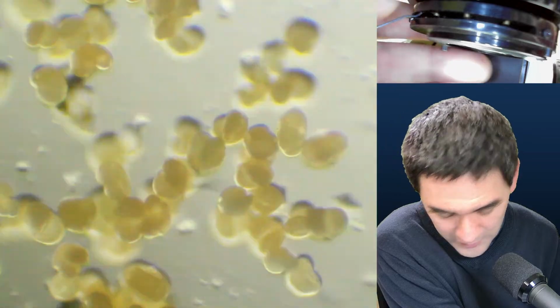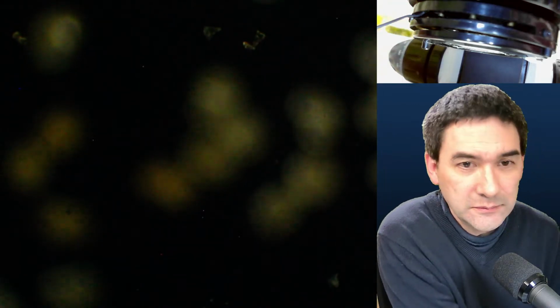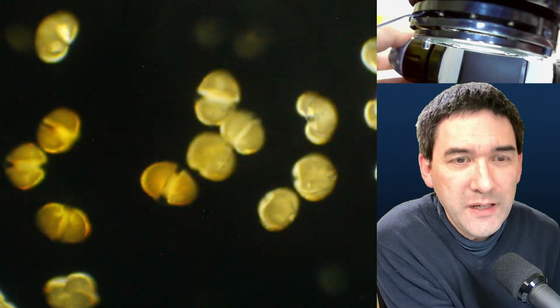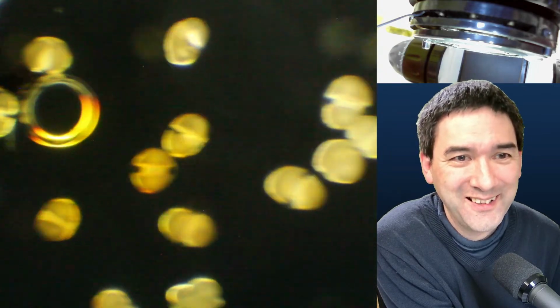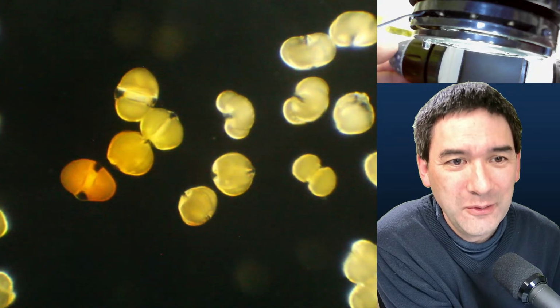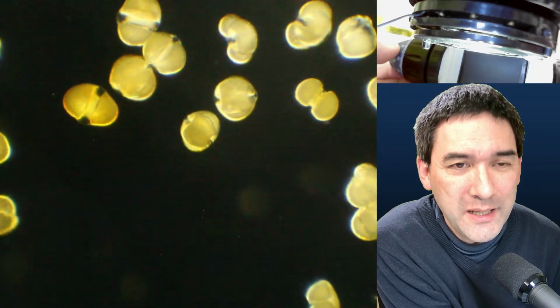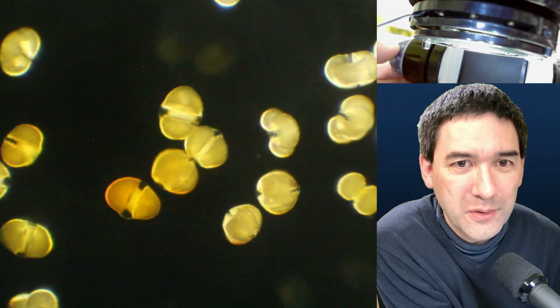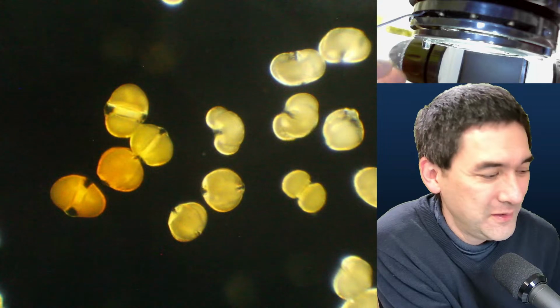And there are two more. The next one is the PVA glue, and then a nail polish. That's the PVA glue. I think it's still one of the nicer ones. Because it is water-based, it's compatible with the pollen, since the pollen will absorb the water. They might swell a little bit.